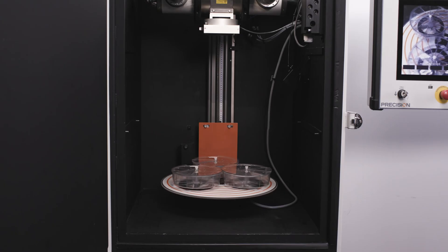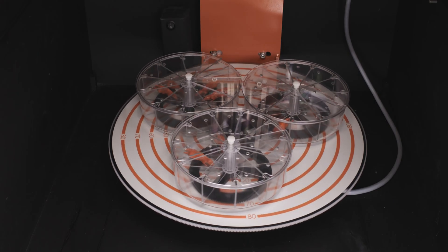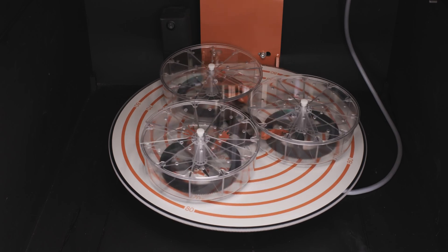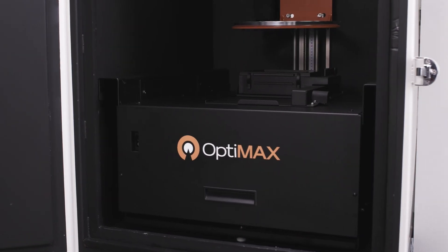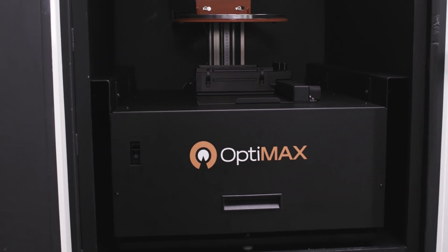A large turntable accommodates three pie cages while rotation ensures uniform dose rates for all specimens during treatment. The OptiMax module turns your X-RAD irradiator into a multimodal imaging system.